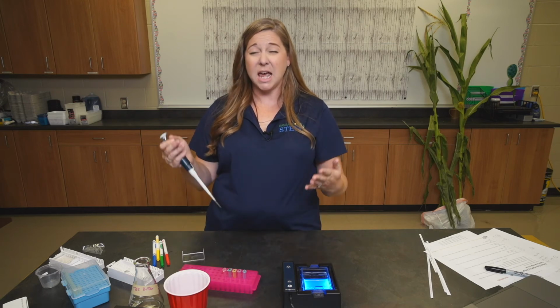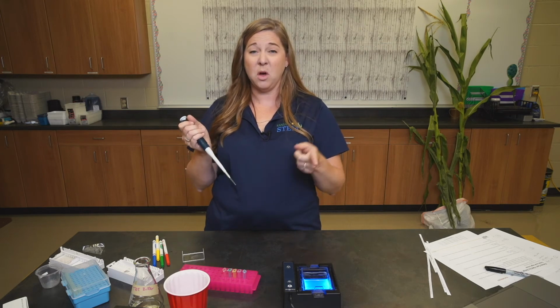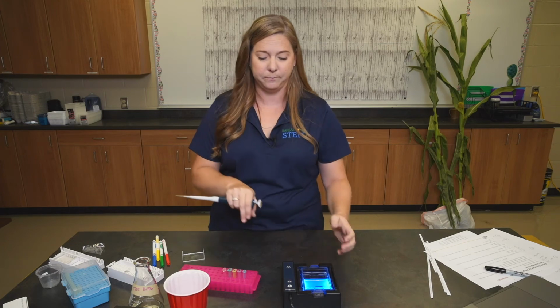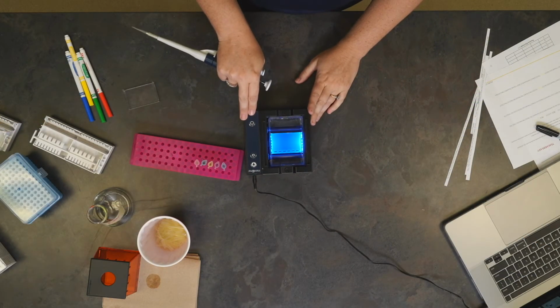To do this, there are a couple of things to keep in mind. Steady hands are very important because this sharp tip will go all the way through that gel. If it does that, all of your sample gets released underneath the gel and it won't travel through the gel appropriately. Place the carriage closer to your workspace.